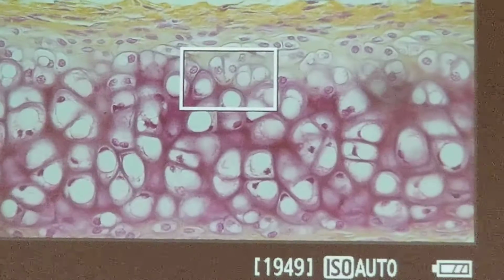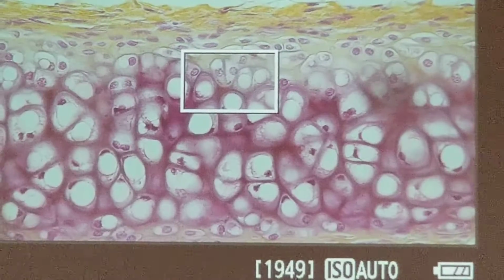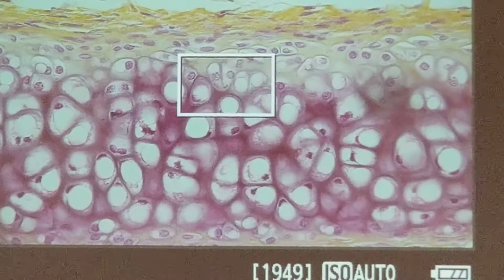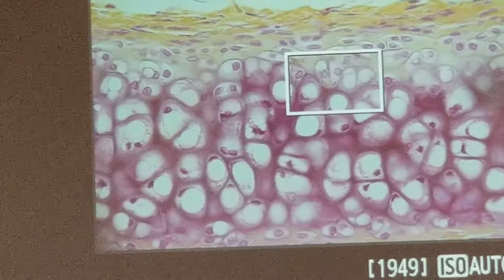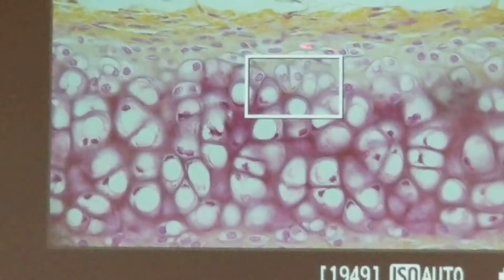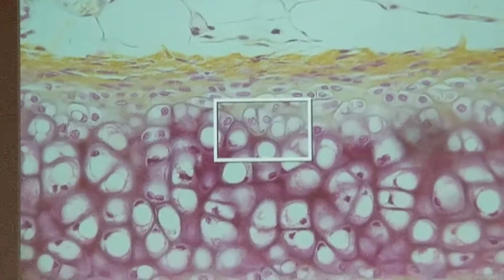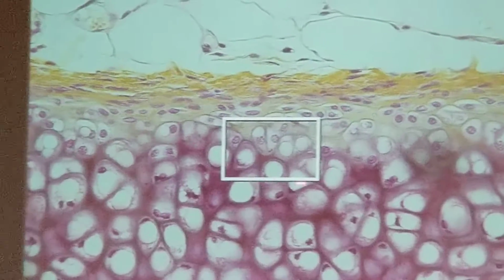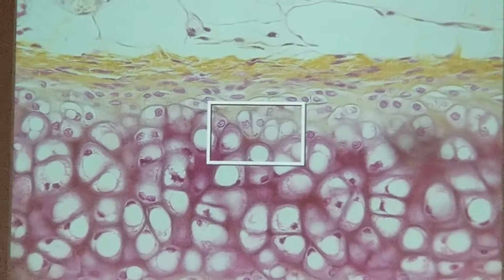And this gets a little confusing, so listen. The third one, perichondrium, put a bullet point next to it, and you can cross out the stuff below that, because the stuff below that is describing to you what the perichondrium is. So you only have to identify the three things: chondrocytes and lacunae, chondroitin sulfate, and then look, here's the perichondrium going across the top. See how it's going a different direction? It's also down here on the bottom if you want to label the bottom. If you just take like this box up here, you just do a little higher than the box, get a few cells in there, show the perichondrium there so you know what it is.